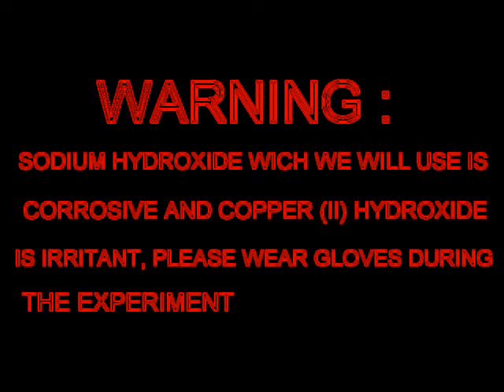Sodium hydroxide which we will use is corrosive, and copper 2-hydroxide is irritant. Wear gloves during the experiment.